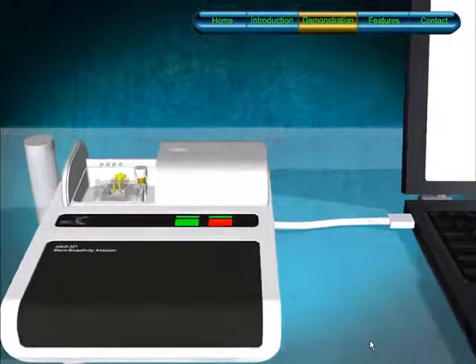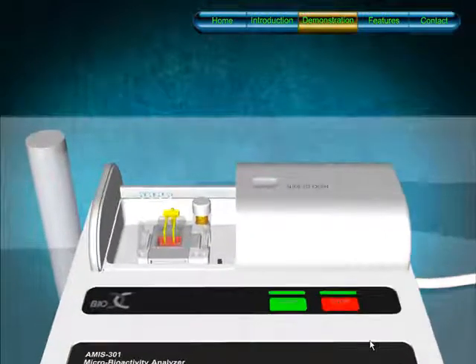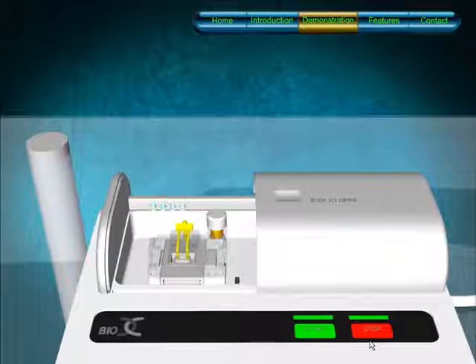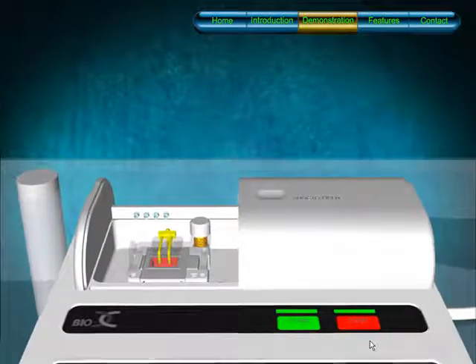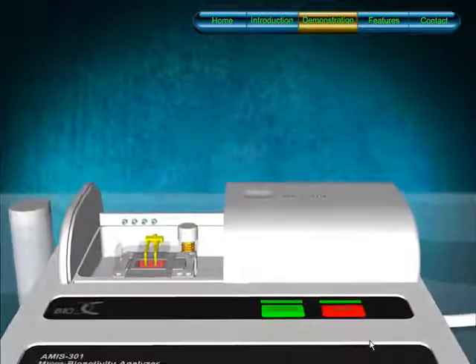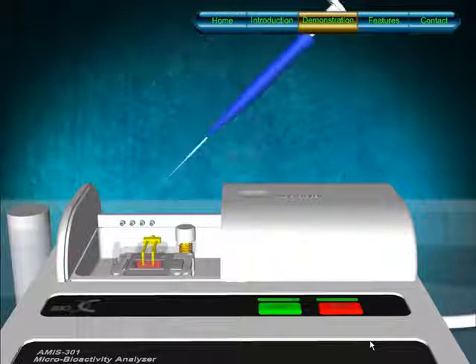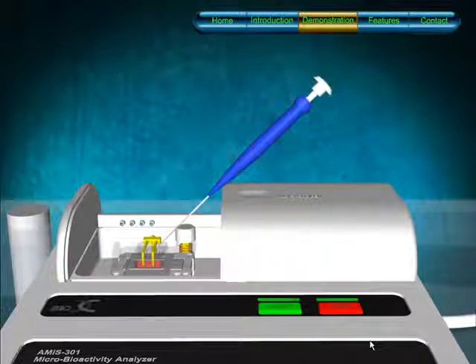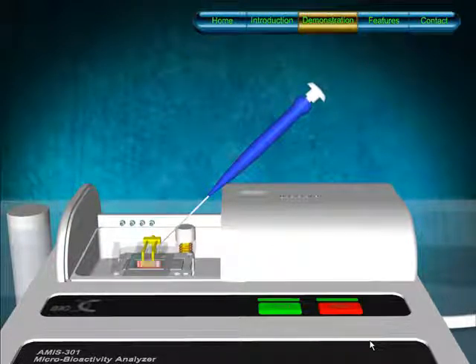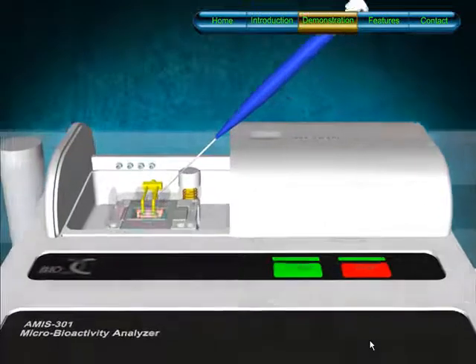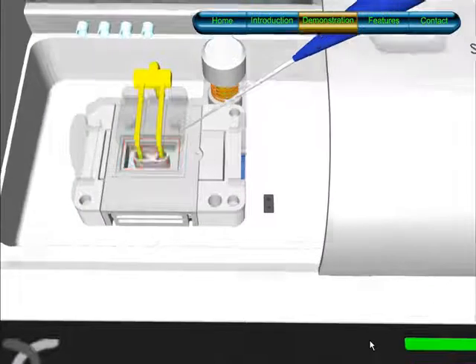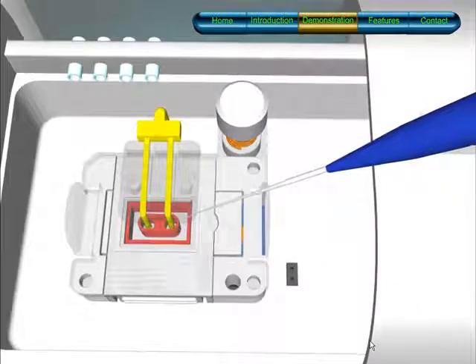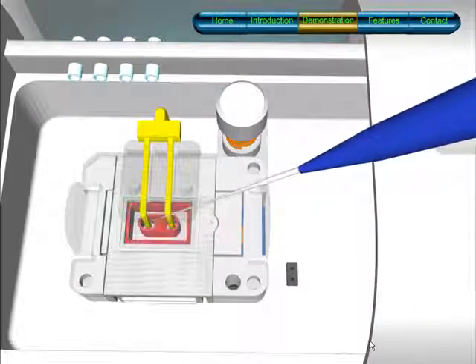This is a sample cell. As mentioned earlier, the CMOS ISFET chip detects enzymatic reactions which generate proton changes. It is based on differential construction. We shall now introduce a buffer in both the control and sample cells.